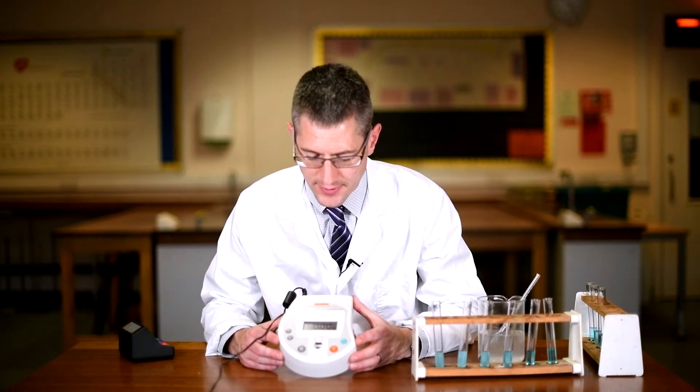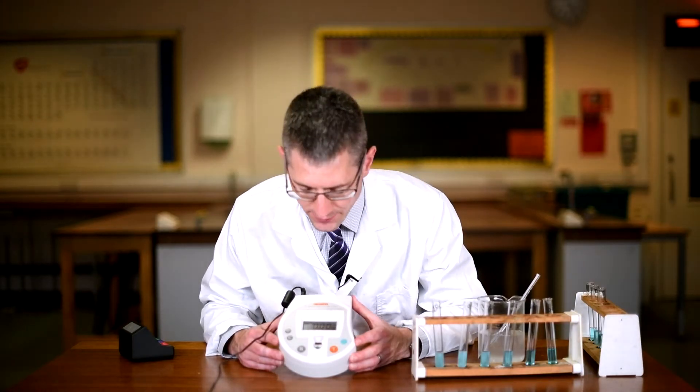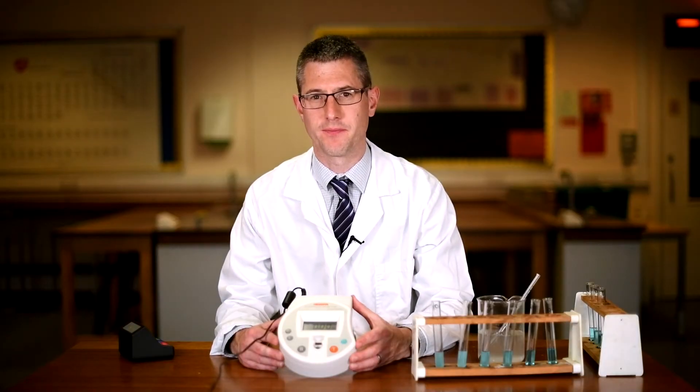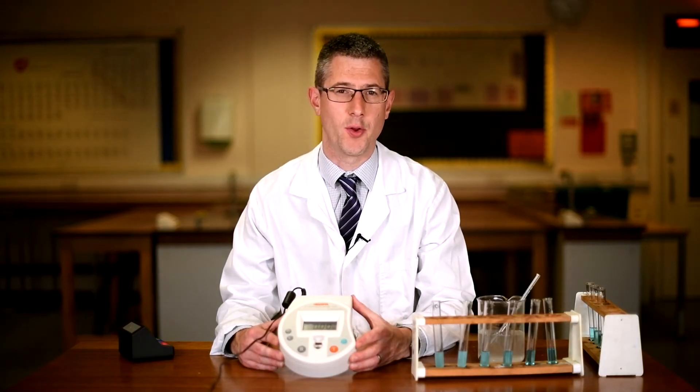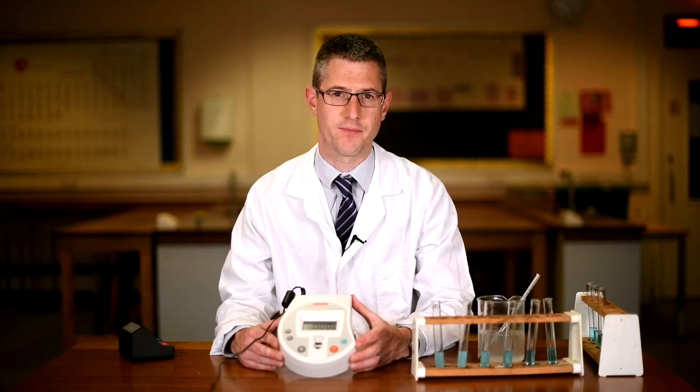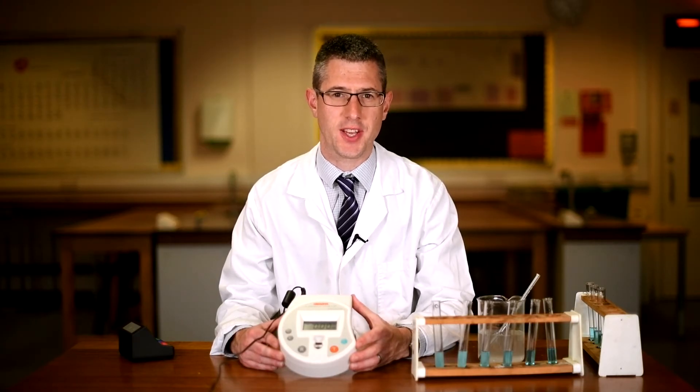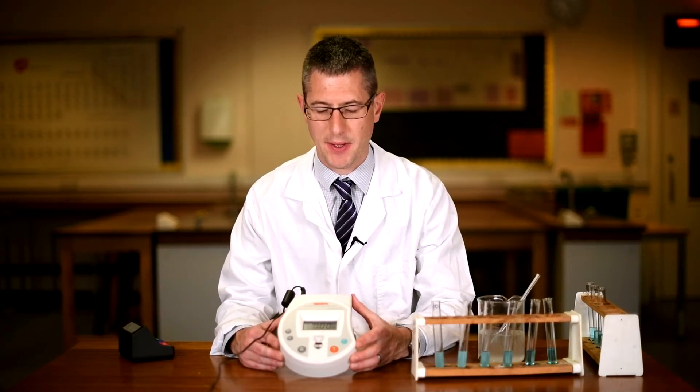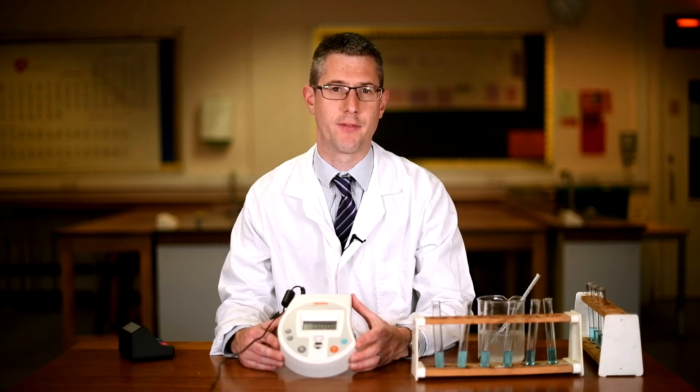Now I've set this colorimeter to a red filter. The reason I've chosen a red filter is that we have a blue solution. Blue solutions are blue because they're absorbing all other wavelengths of light, all other colors of light. If we want to see a change in absorbance reading, we need to choose a filter of the complementary color. In this case, the best color filter I had was a red filter.